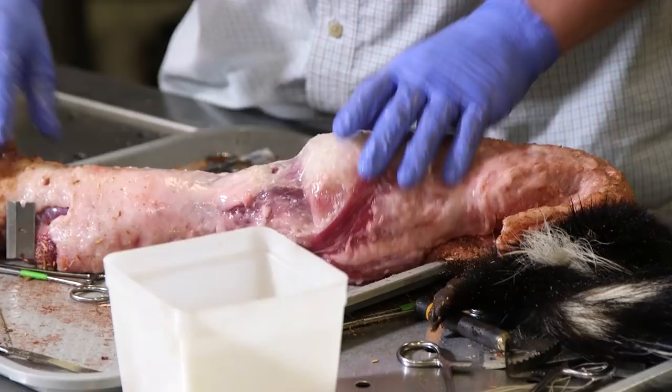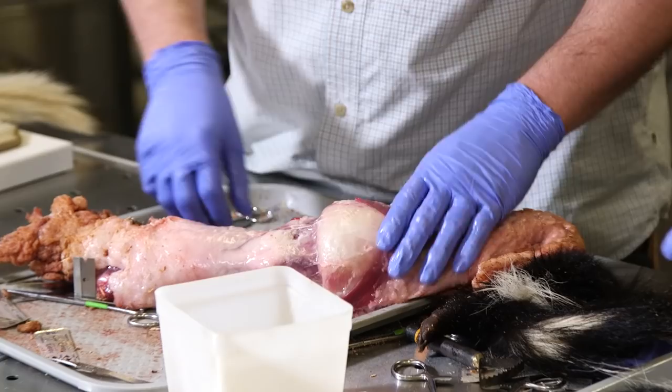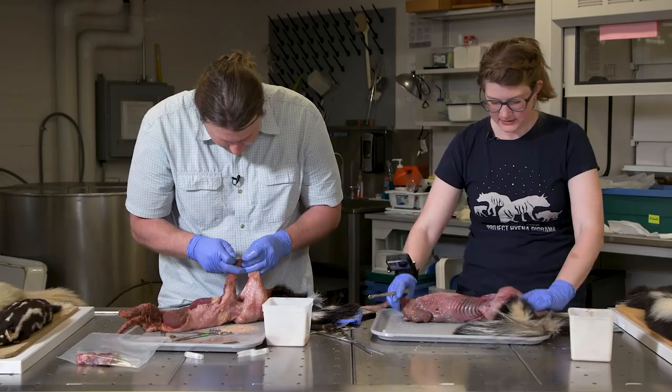It's so chubby it got a razor blade stuck in its fold. Look at that — a fatty skunk.